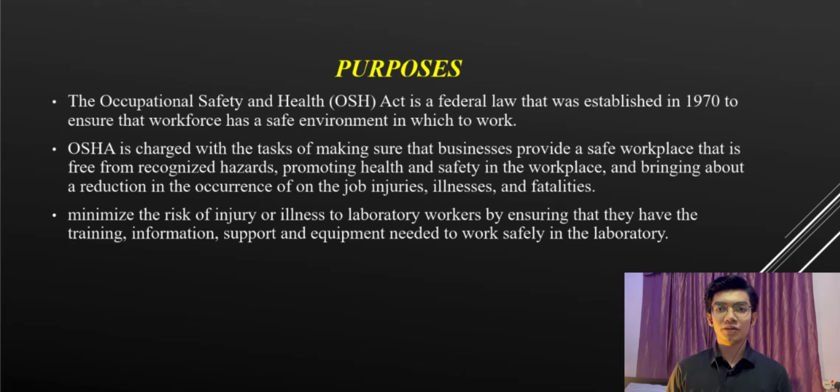I'm from DKA 4E. Today I'm going to present about the safety laboratory lab. So what is the safety laboratory lab? The purpose is the Occupational Safety and Health Act, OSHA, a federal law that was established in 1970 to ensure that the workforce has a safe environment in which to work.